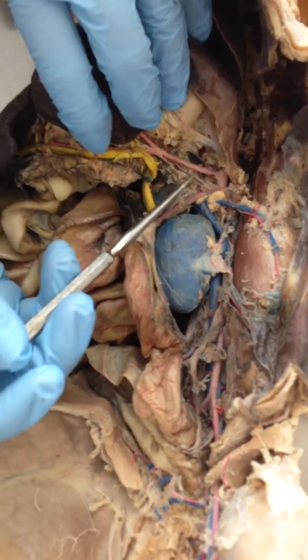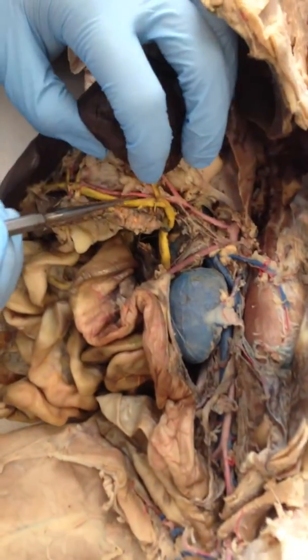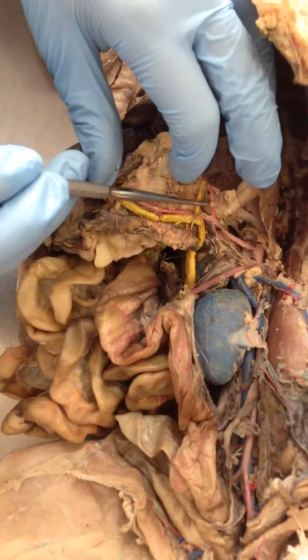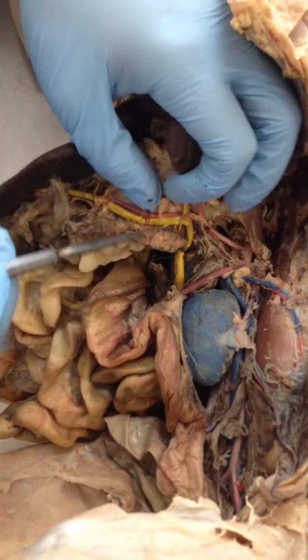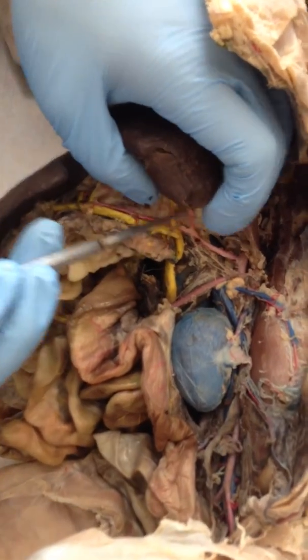And then the first one that comes off is something with a C. Celiac trunk? Celiac trunk. Yeah, and then the first one off of the celiac trunk, is that the hepatic? Is it going to the liver? No, it's not the hepatic. Is it the splenic? It's going to the spleen.